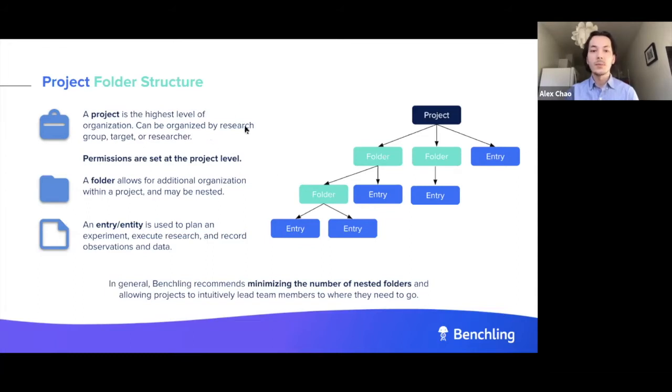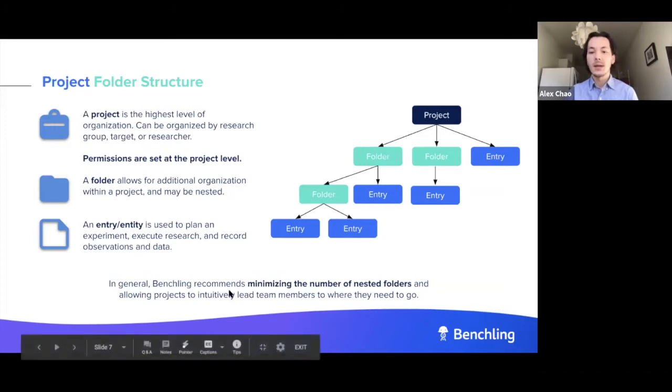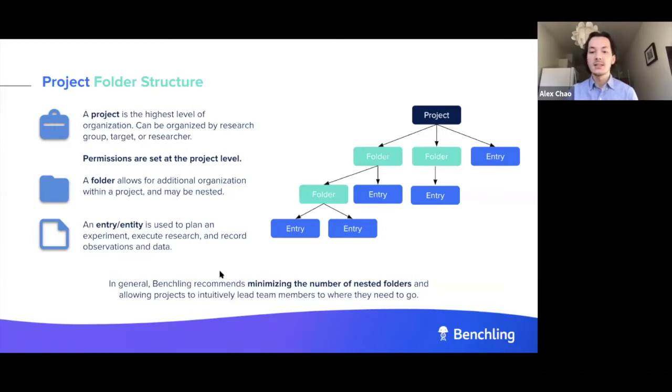So there are multiple ways that groups that use Benchling can organize their projects. Some groups may organize them by research group or target, or also by an individual working for that organization. And again, as a best practice, we generally recommend minimizing the number of nested folders.